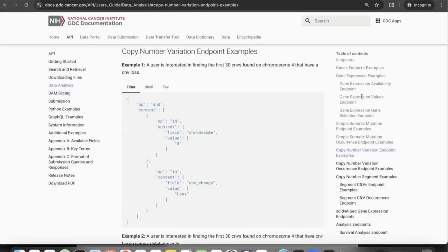Okay, so I saw that there were a few questions asked during Shin's demo. So Shin, I want to bring some of this to your attention. So for the first question, what is the data/tracks being presented in the PAX5 illustration? So where does that data come from?